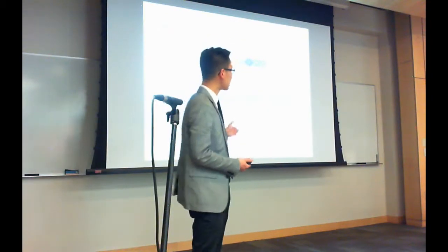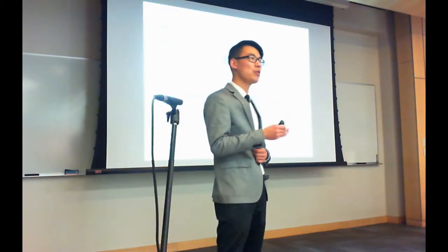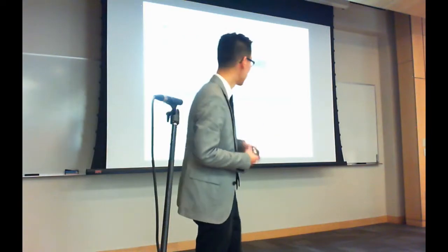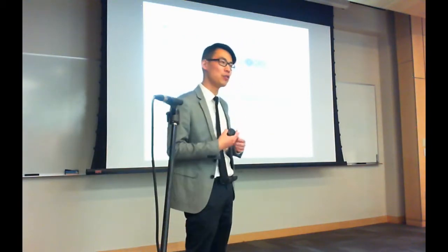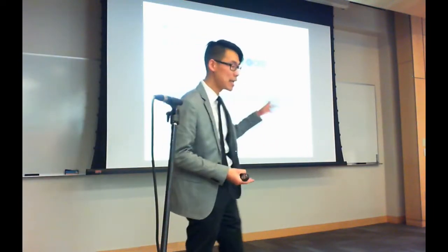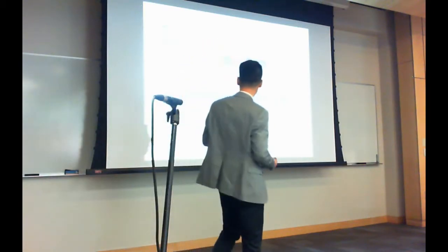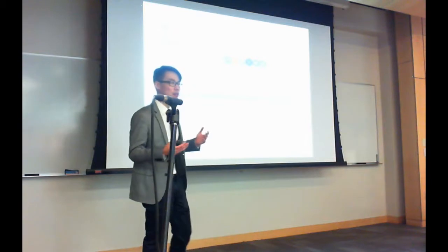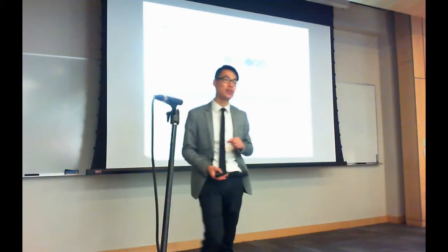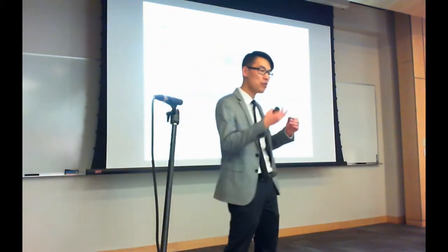And in difference from the natural product space, for proteomics, we actually are much more able to understand the fragmentation of peptides. So we can actually predict them. And so there exist computational tools where we can reliably identify peptides in actual mass spectrometry data. But the downside is current libraries out there, they're small. They don't cover a lot of the human proteome. Out of nearly 20,000 proteins in the human proteome, only 12,000, 13,000 have any unique peptides that map to them.